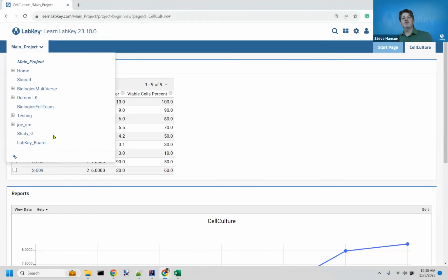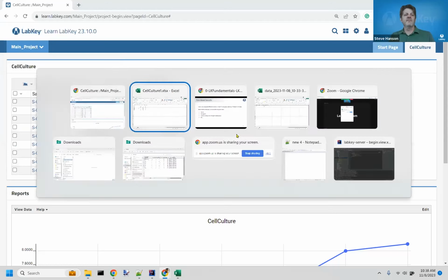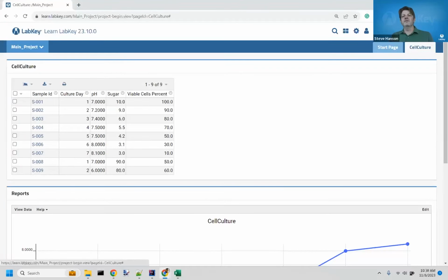Why? Because this user, test2115, has the reader role in these folders only. In the other folders, test2115 has no roles and has no way to interact with any of that stuff. They can't see it. They can't change it. They don't even know it's there. So that's why folders are so important in security. One of the reasons why folders are so important.